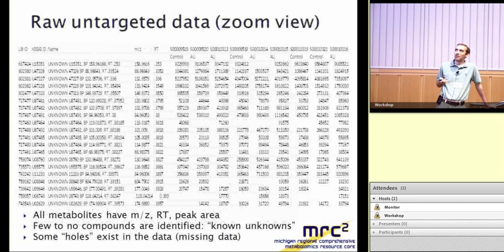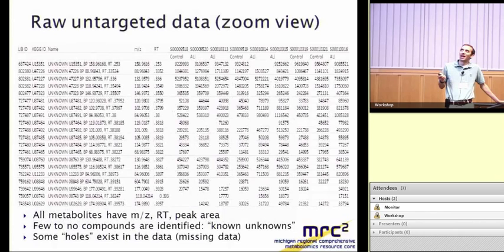We have some assigned sample ID number or metabolite ID, which are just numbers effectively assigned by the data analysis procedure that we use in the core lab. And what you see on the top of this list is a whole lot of things listed as unknown. We'll talk more about that in just a second. What we do have for every metabolite is a mass to charge value. That's the ion that was produced in the mass spectrometer. We have a retention time. Here, these are the very earliest eluting compounds from the method. These are sorted just coincidentally in order of retention time.